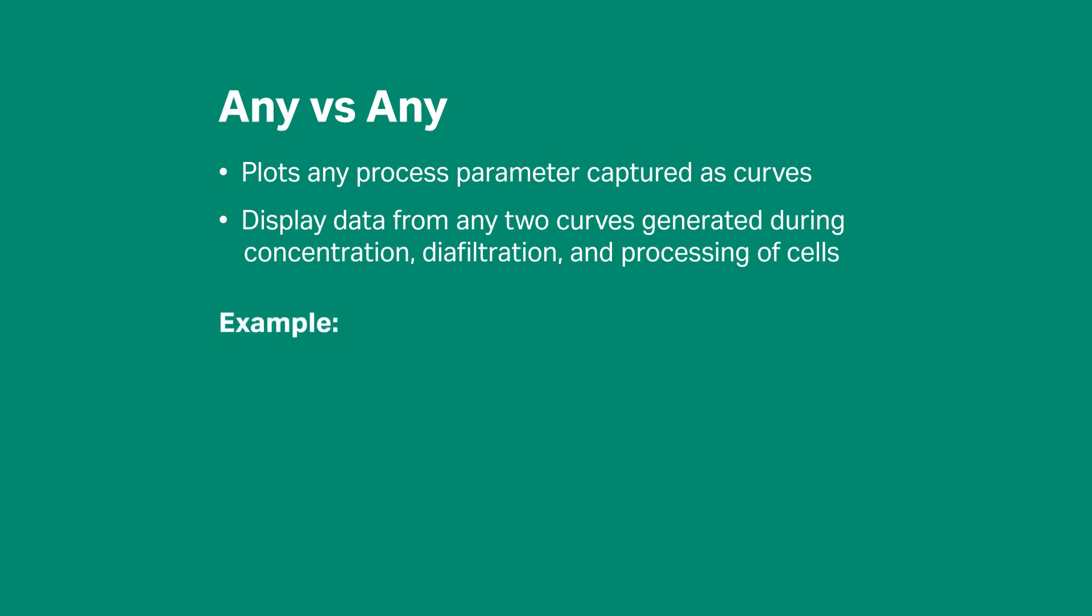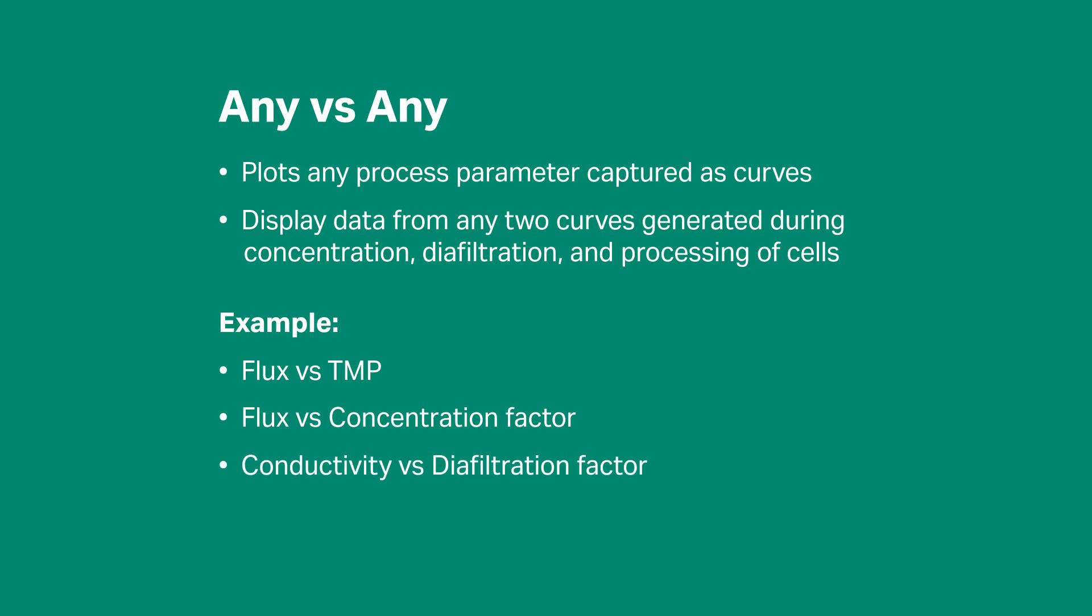you can view flux vs. transmembrane pressure, flux vs. concentration factor, conductivity vs. diafiltration factor, or UV vs. diafiltration factor.